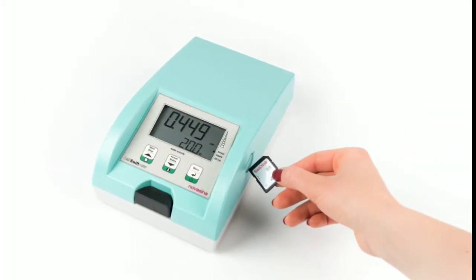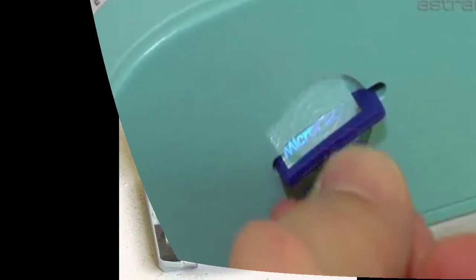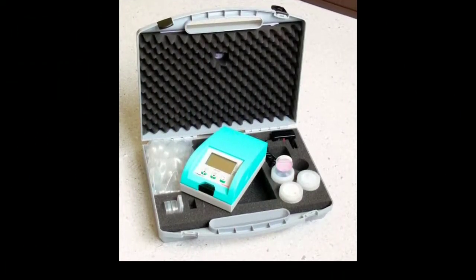With an SD card interface, data logged on the SD card can be transferred to the PC for visualization, analysis and archiving. This water activity measurement instrument is versatile, flexible and portable.